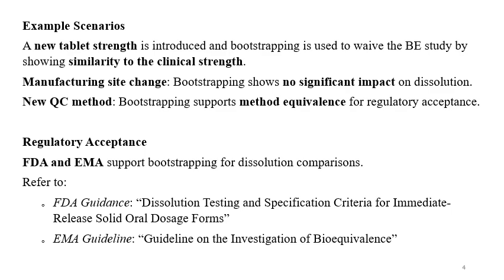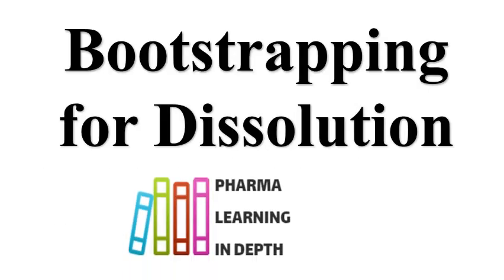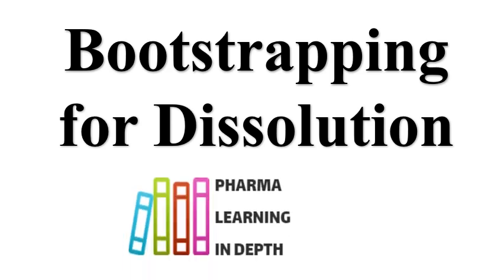I request you to go through the guidelines provided by FDA and EMA for the dissolutions and for bioequivalence investigation so that you can understand the bootstrapping requirements in detail. So this was the introduction for bootstrapping dissolution, and this will help you to understand bootstrapping dissolution. I request you to go through the different softwares and do some example calculations, generate some dissolution profiles with high variability, and understand bootstrapping.